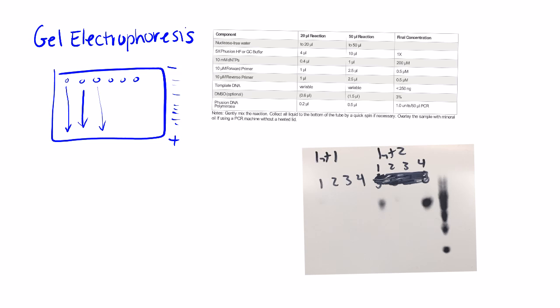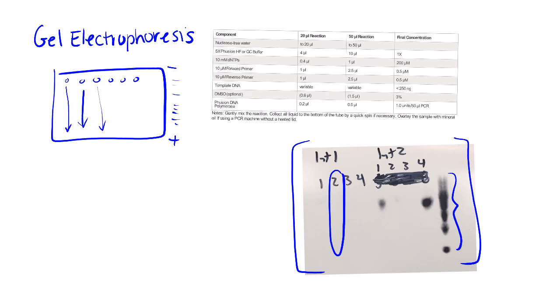As you can see here, this was the control, and we were group 2. We had no movement of our DNA, which suggests, but of course does not completely solidify the fact that our PCR solution may not have completely worked as we had hoped it would.